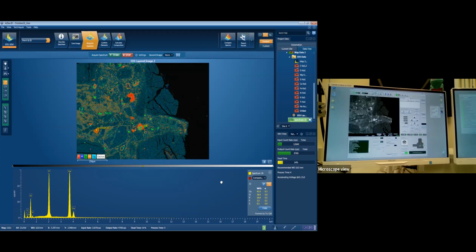It's quite a pretty mineral actually. It ranges between green and pink depending on what's in it. There's a couple of different versions of apatite. We can have fluoroapatite, which is this one, so it's got fluorine in its crystal structure as well. Or you can have chlorapatite, which has chlorides, which is less common. Most apatite will be fluoroapatite. If you ever get the chance to see some in person, I would highly recommend. We've got this big titanium splodge up here.